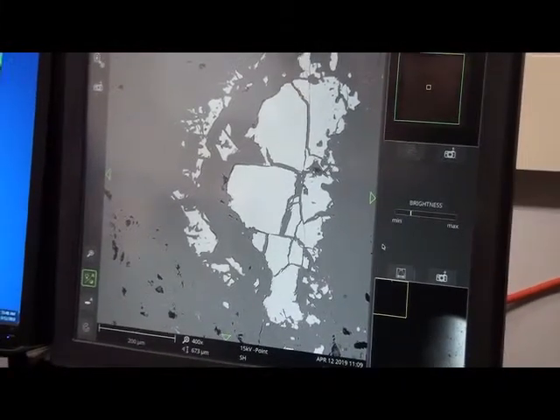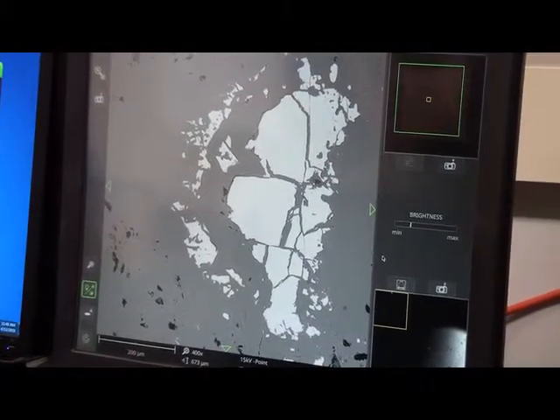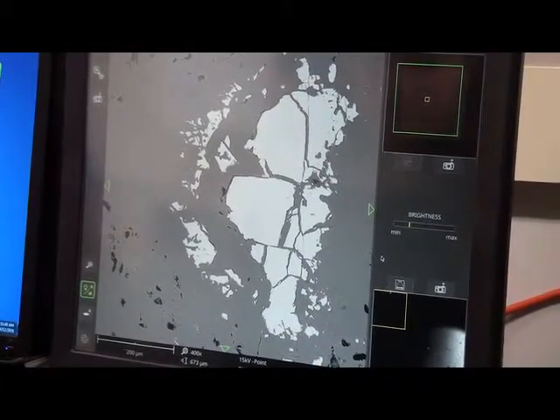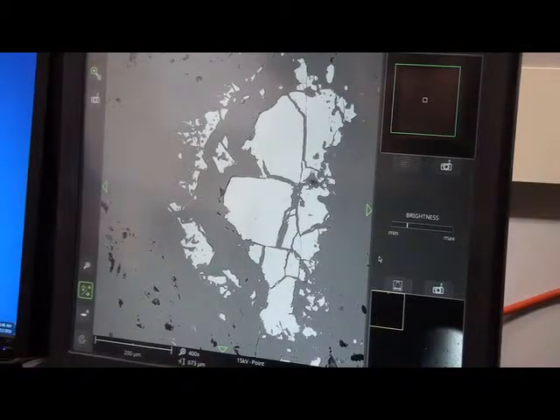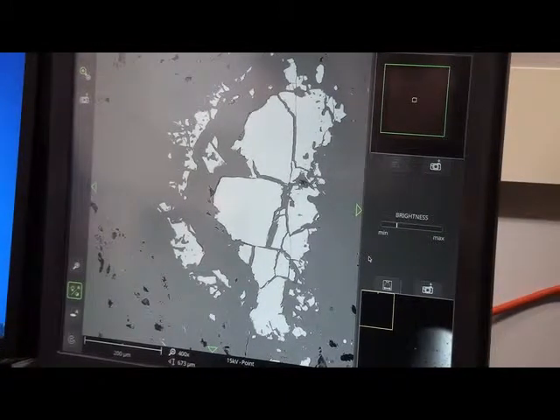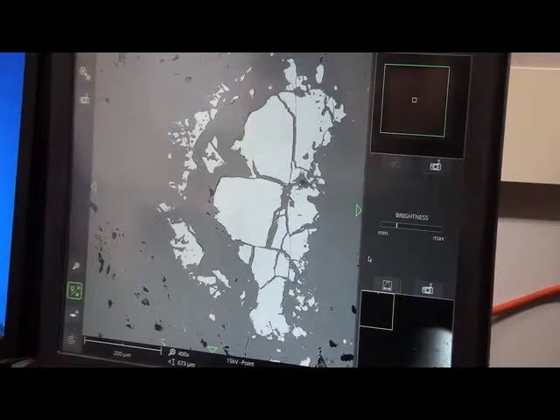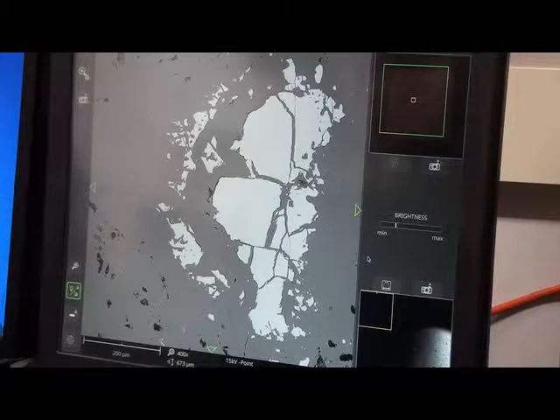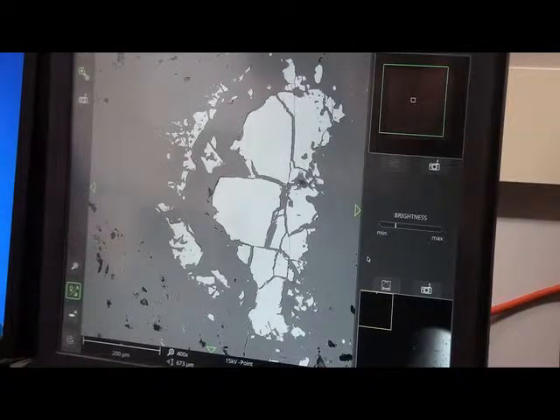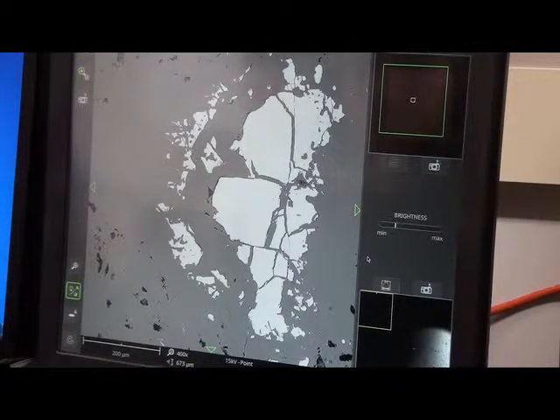This rock was originally what is known as an ultramafic rock, rich in elements such as magnesium and iron but also very rich, as most rocks in the crust are, in silicon and oxygen.